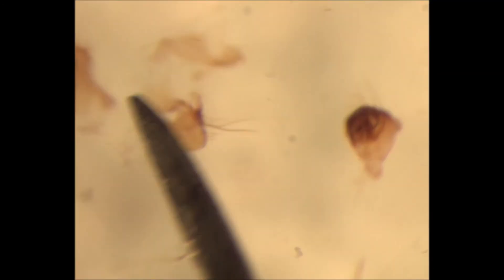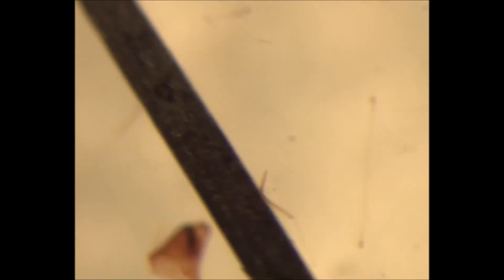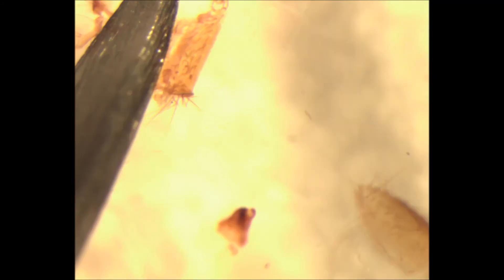I could just take away this top part of the head, cut here that has the antennae and the mandibles. Not using the lower mouthparts much today; they can be torn away too. Okay, how's this tissue looking? It's a little bit messy. I'll get a number one insect pin so I can hold this all down and get rid of the parts that I don't want.